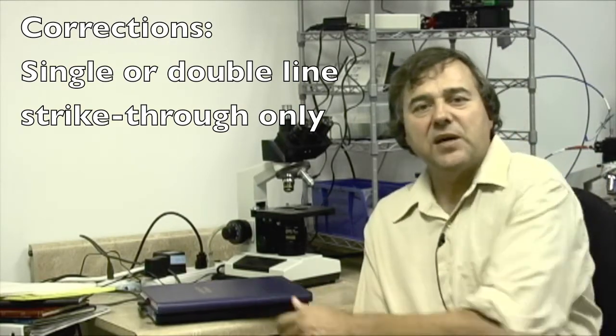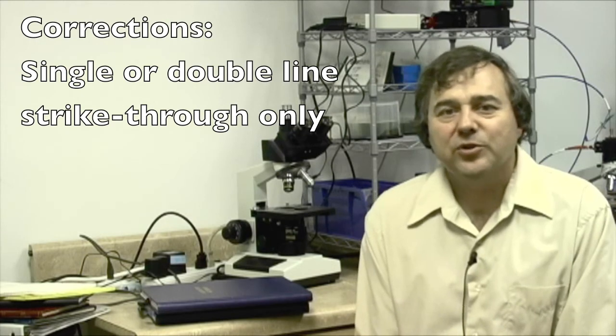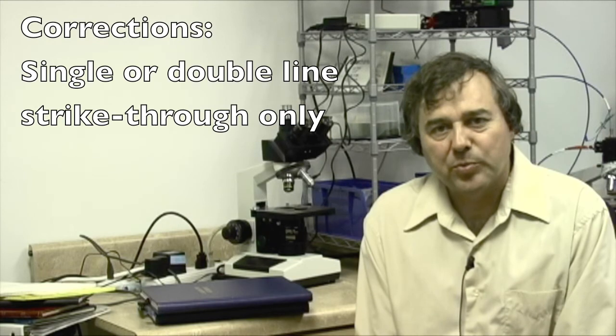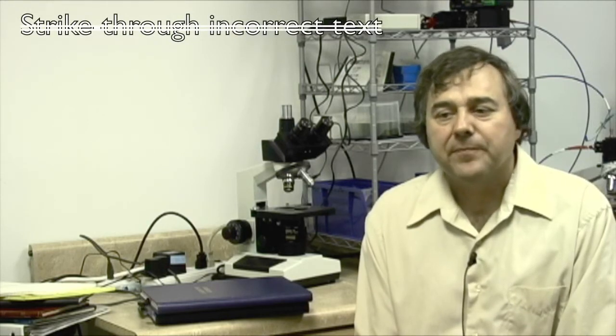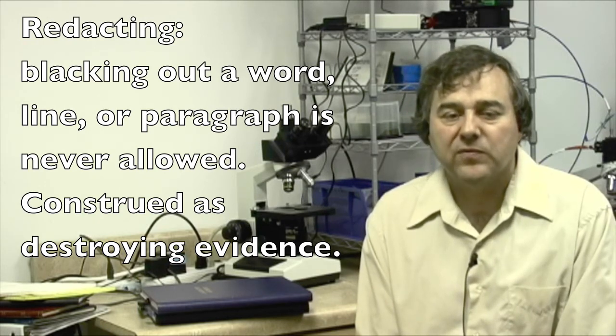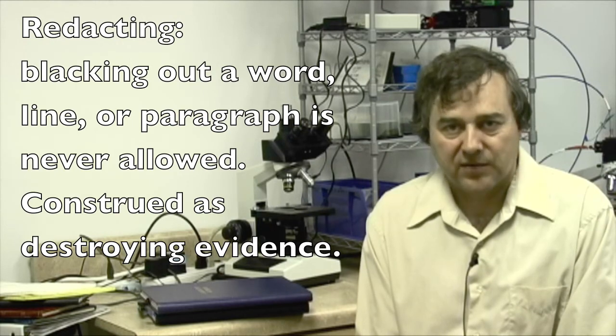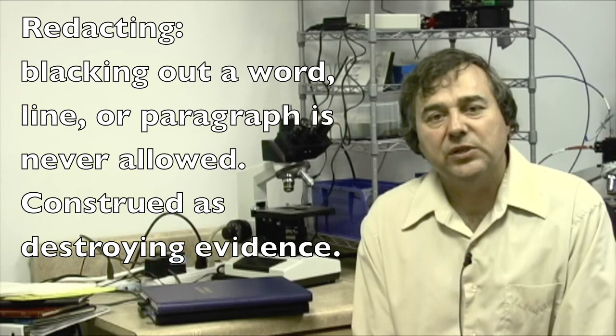Corrections: You've written something down and you made an error, so now you have to correct it. Preferably one, I usually use two - one or two strikethroughs through a particular line or every line in a particular paragraph is the proper way of doing that. You don't want to blacken it out. You want whoever is reading your notebook later on to be able to see that and know what was there. Redacting a particular paragraph by completely blacking it out might be read sometime in the future as you got a result that went against what you wanted and you hid it, and it can be something that might be raised as a point of law in a patent dispute. So we never redact, we never black out a whole sentence or paragraph or even a word. Don't worry about the embarrassment - it happens to everybody. One or two strikethroughs is sufficient and then of course put your initials next to it indicating that you struck through it.